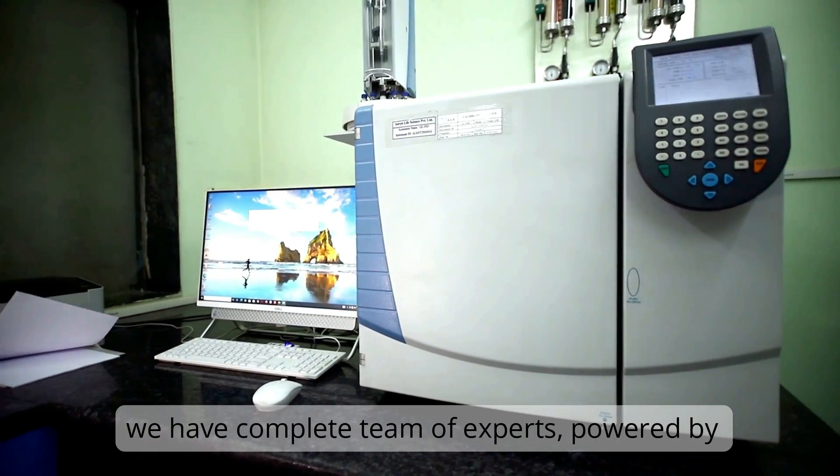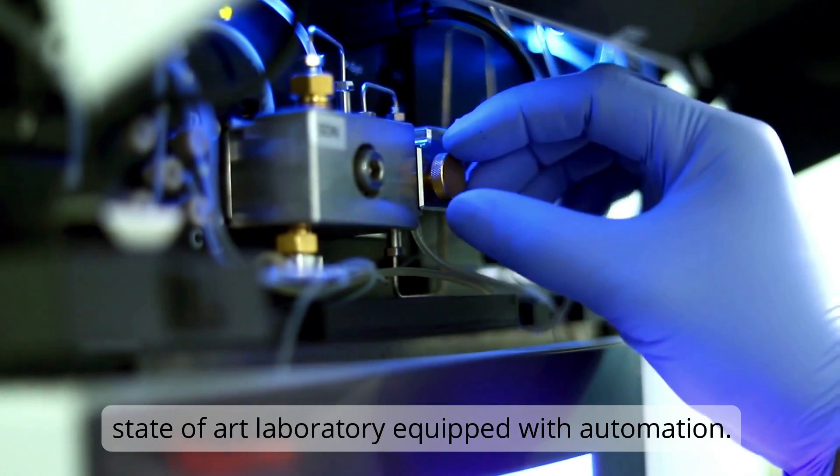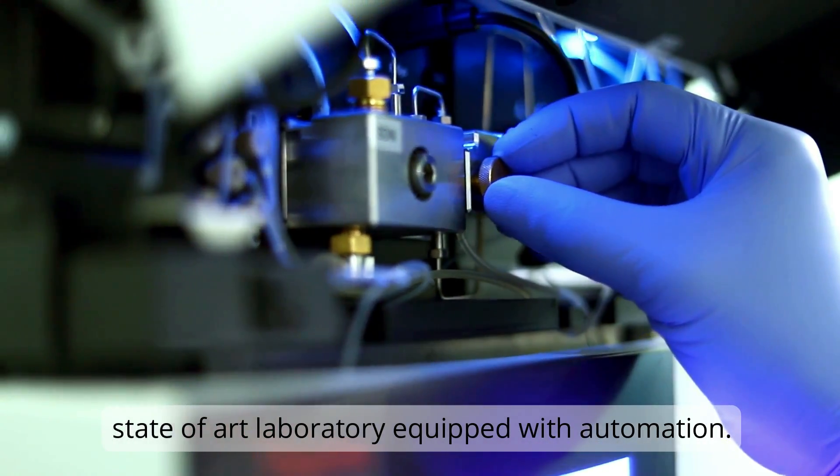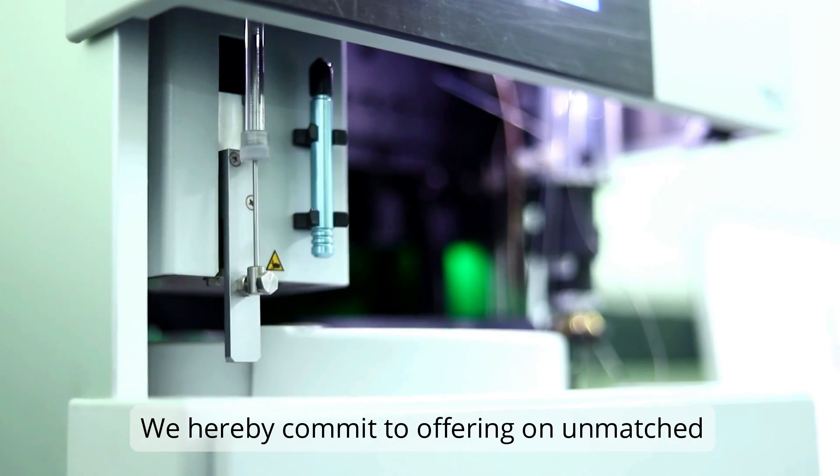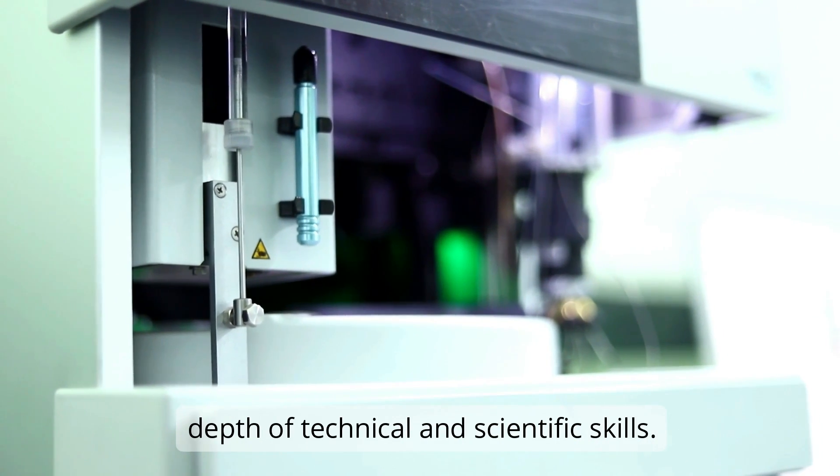We have a complete team of experts, powered by state-of-the-art laboratory equipped with automation. We hereby commit to offering an unmatched depth of technical and scientific skills.